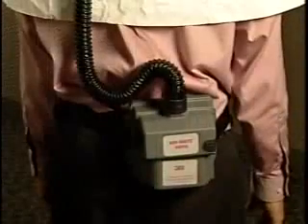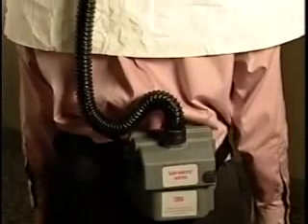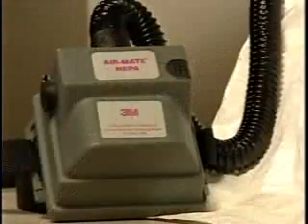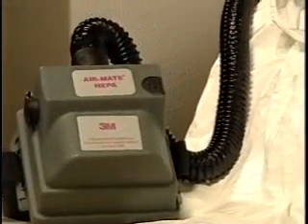A powered air purifying respirator, or PAPR, with a hood may be an alternative for a bearded healthcare worker or those who are otherwise unable to pass the fit test requirements. PAPRs use a blower to force air through air purifying elements into a loose-fitting face piece or hood that covers the entire face and head. A battery and cartridge fit at the waist.